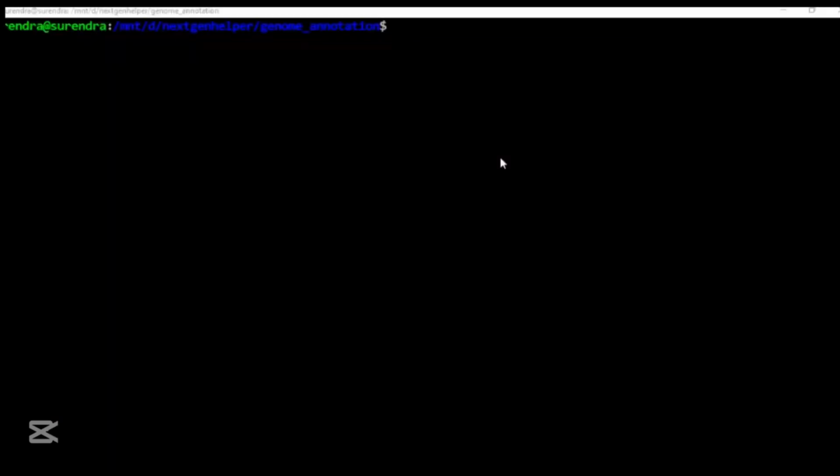Given a BAM file, how can we convert that into a FASTA sequence? So that alignment you want to convert to a FASTA sequence. FASTA sequence, yes. You can create the consensus sequence there, right? Yes, sir. How, sir? Using SAMtools. Okay, right? So SAMtools. Yeah, you can use SAMtools to do the alignment and then get some consensus sequences from there, right? Can you say something, sir? I mean, with SAMtools, which command do we have to use?